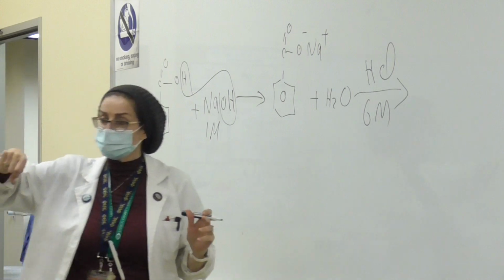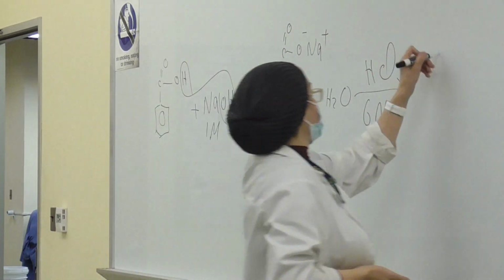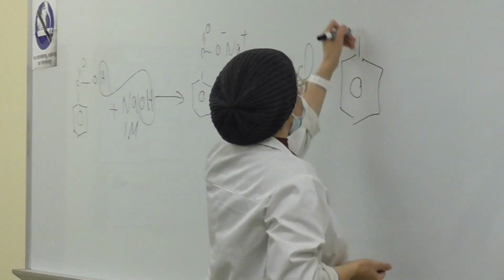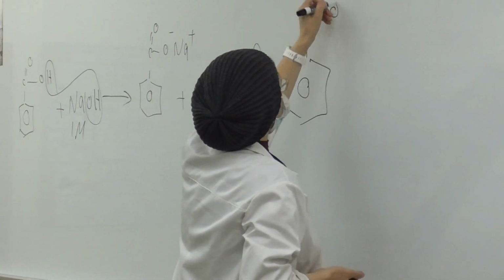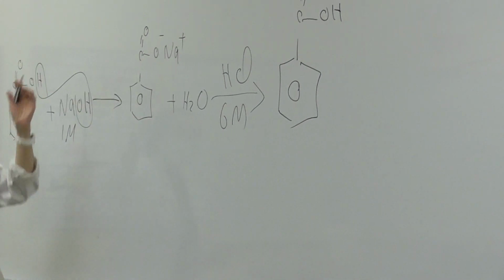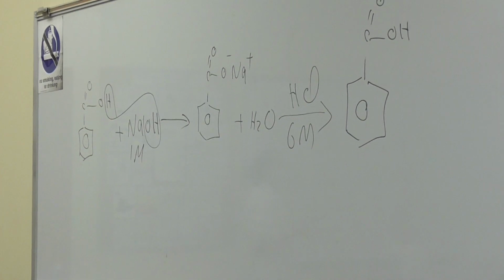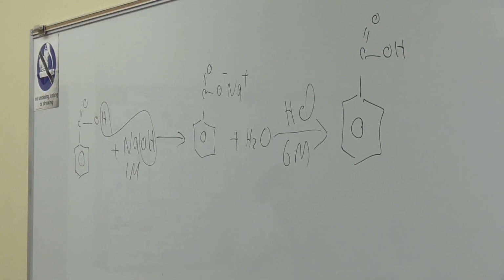So if you see precipitation, that reaction went through, right? So we're going to end up having, again, acid and base, and this is going to go back to OH. So this is Cl minus in the actual solution. So that's what you are going to observe today, all right, for the acid and base.